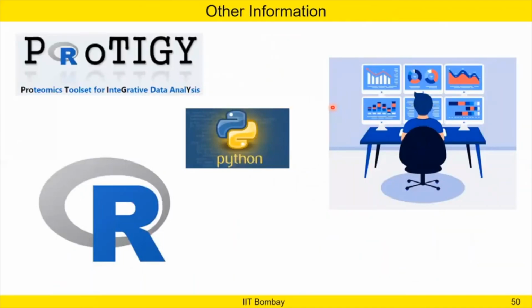So now the thing is that data analysis is not restricted only to MetaboAnalyst, and once you get a good idea in MetaboAnalyst, I suggest that you come out of that software and start exploring more in R and Python. These coding platforms will give you an idea of what we can do with the data, and what different kinds of plots we can make. For example, MetaboAnalyst gives the distribution curve of the whole data, right? But if you generate a plot in Python, you can see how each sample is looking, how the distribution of each sample looks, and how the distribution of group 1 and group 2 looks. That will give you an idea whether your samples need scaling or not.